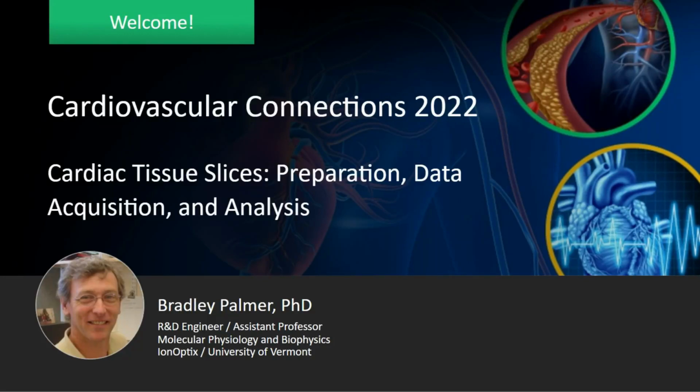Good morning, good afternoon, and good evening, everyone, and welcome to the 8th webinar in the Cardiovascular Connections 2022 series. Today's webinar is titled Cardiac Tissue Slices, Preparation, Data Acquisition, and Analysis, featuring Dr. Bradley Palmer, Assistant Professor of Molecular Physiology and Biophysics at the University of Vermont. Today, he will demonstrate the challenging preparation of cardiac tissue slices and measurement of force and calcium.